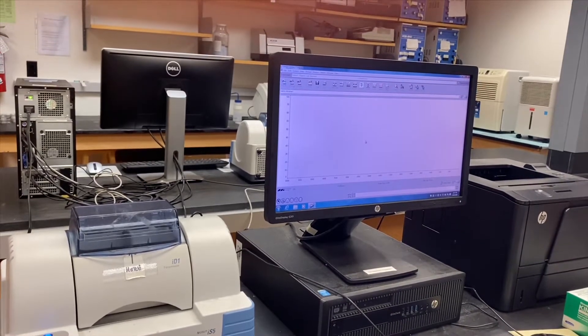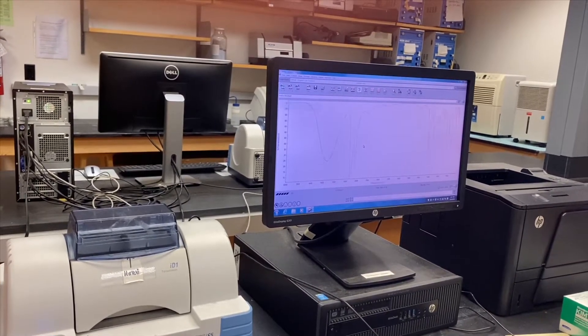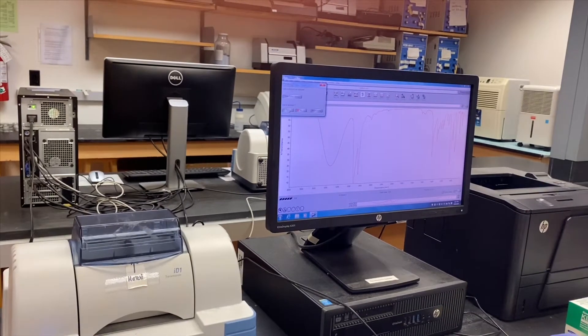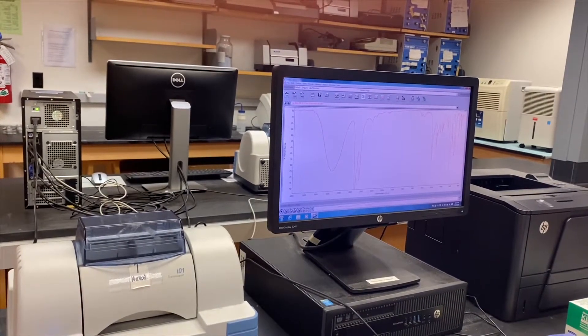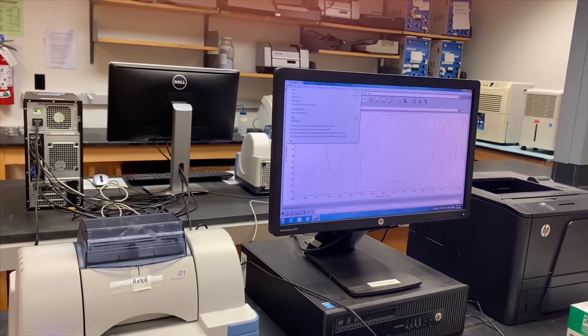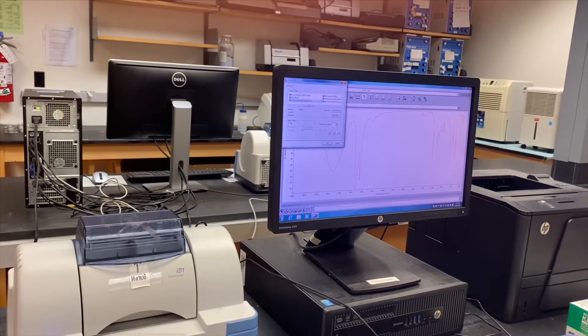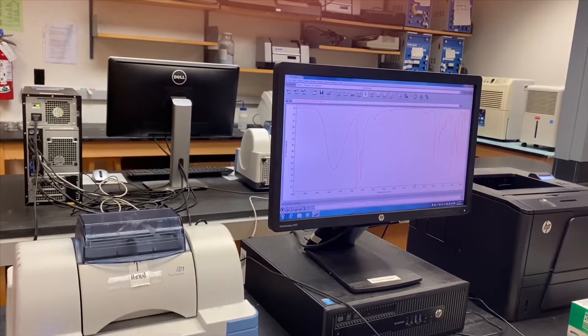Your professor will have the machine set up for you. Before you take any sample, the spectra will appear on the screen within a few moments, and you can print it using the same machine as well.